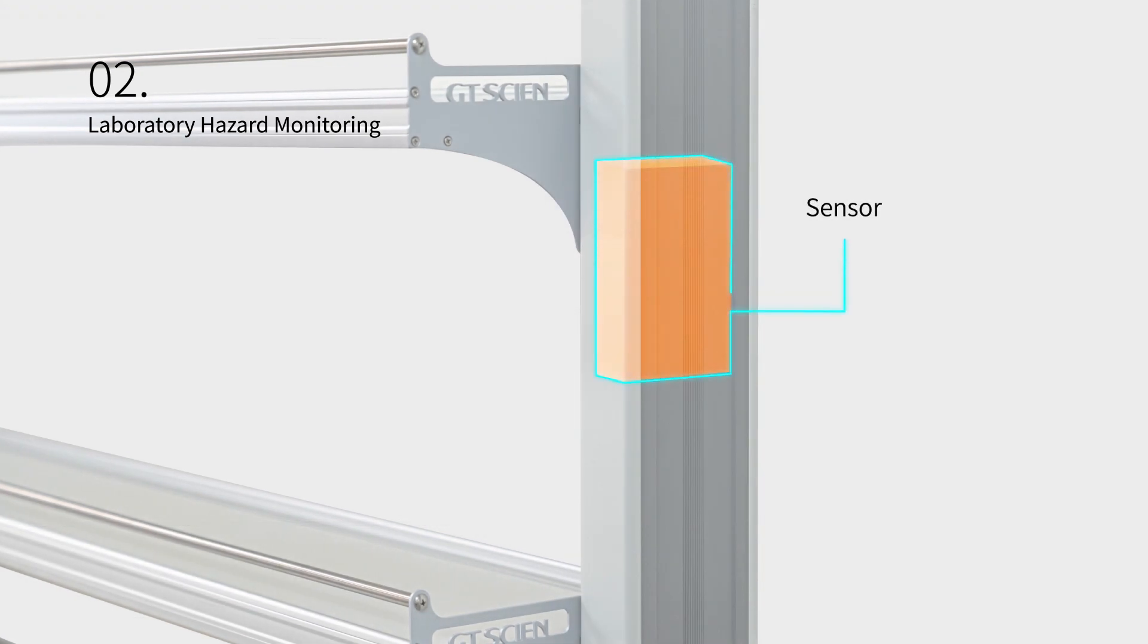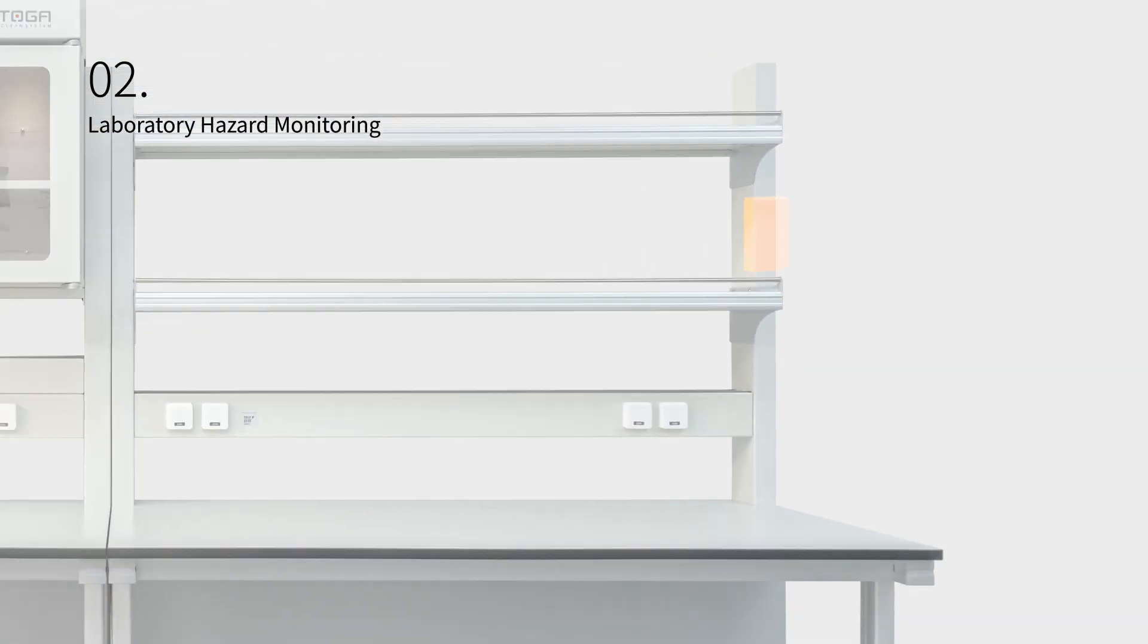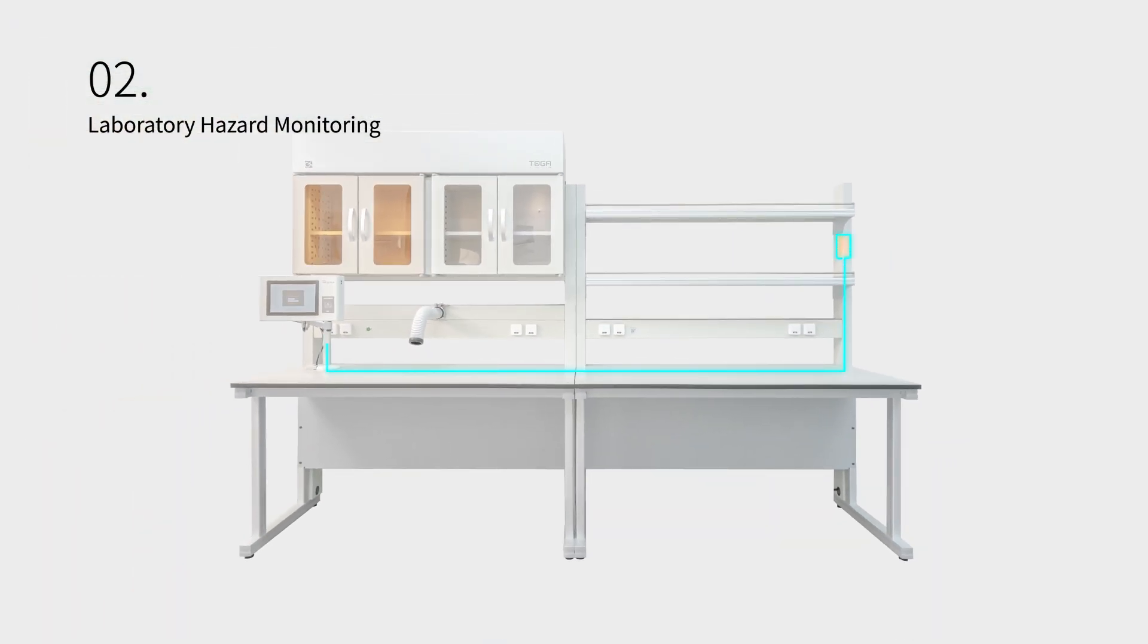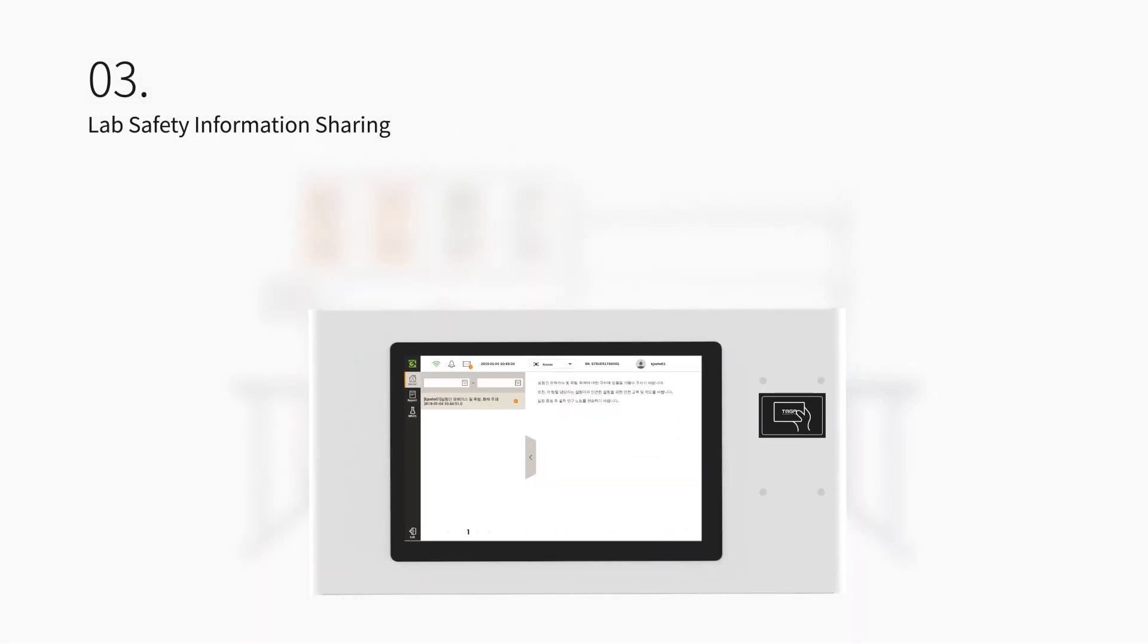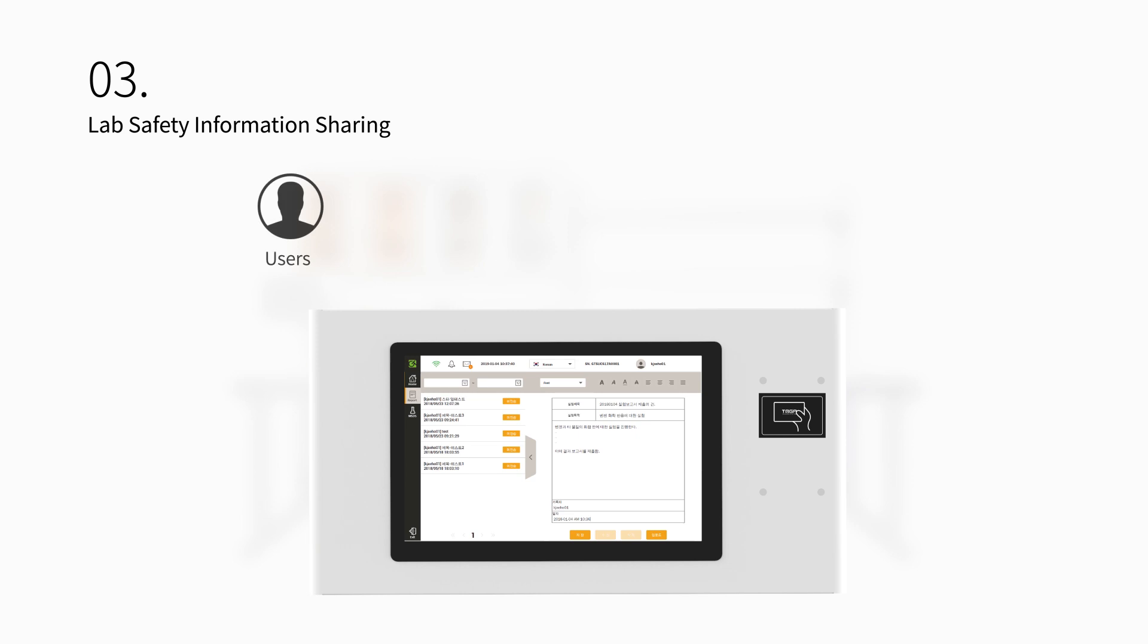Built-in sensors detect risk factors such as gas and carbon dioxide concentration in the air. When gases in the environment exceed safe levels, push alarms are sent through mobile and web applications to alert researchers in real-time and prevent them from chemical exposure.